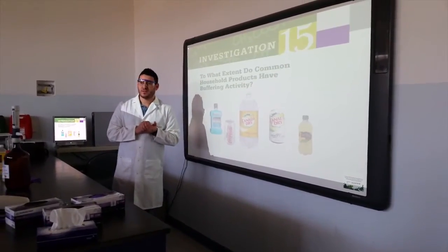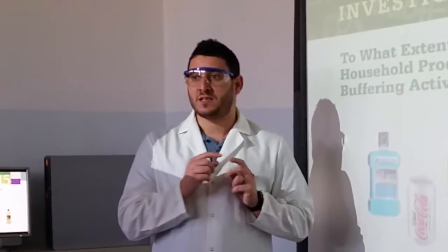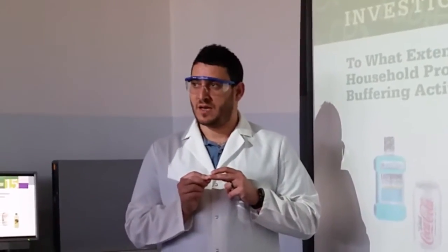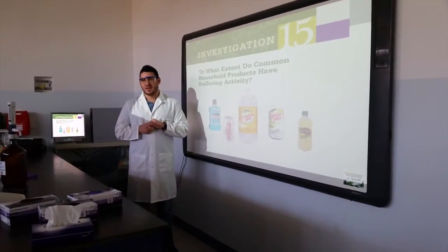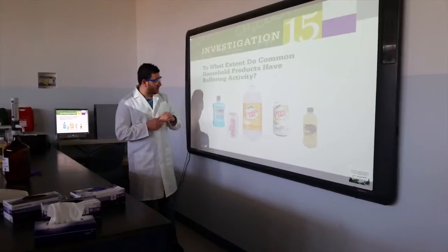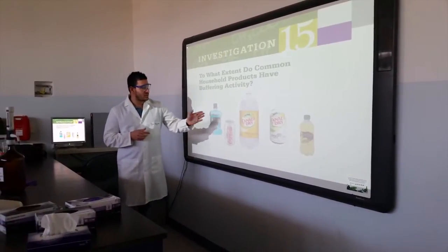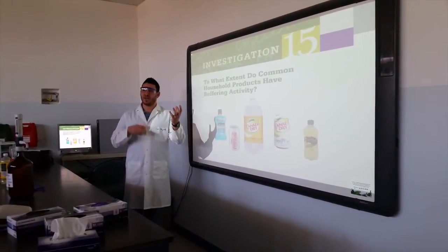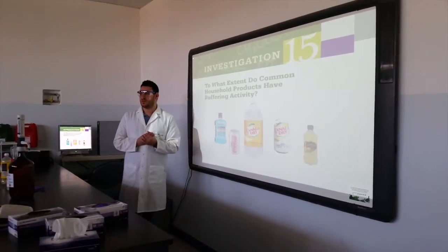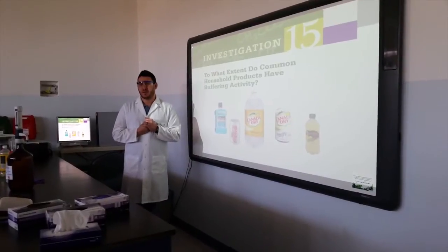You know, for a buffer solution, you need to have two main components, which are either a weak acid and its conjugate base under, like, salt form, or a weak base and its conjugate acid. Now, if any of these products contain a mixture of the weak acid and its salt, it's going to be a buffer. Or a weak base and its salt is going to be a buffer.